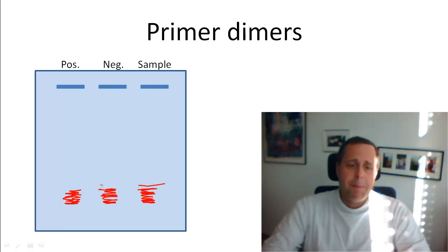Sometimes you also get a sharp band up here, and that's typically reactions of one or two primers with themselves to amplify a short PCR product called the primer dimers. That's not what you want, but that happens frequently.